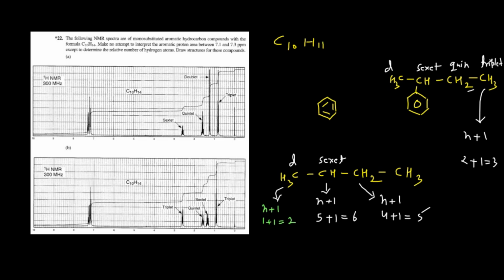And now if you see the different kinds of the hydrogens which are present here, I already explained to you, in the mono-substituted benzene ring, this will produce a multiplet M which is resonating near about 7.1 ppm. So you have fixed this sextet, which is this one, right? And then the quintet, which is this one, right? And then a doublet, which is this one, and then again a triplet, which is this one.